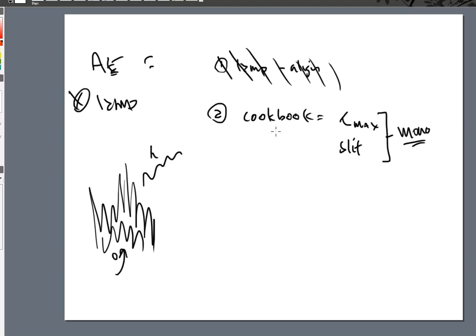So the cookbook will provide these, and whenever you choose the atomic emission in the software, like it does with the lamps, it will just automatically, most of the time, pull in the proper lambda and the proper slit width that it needs in order to measure that particular metal.